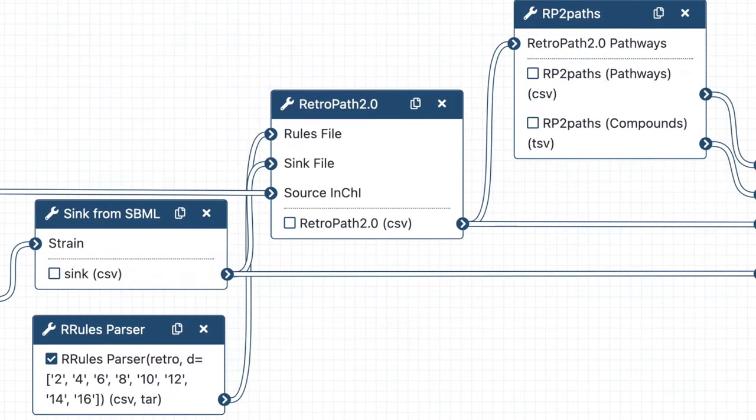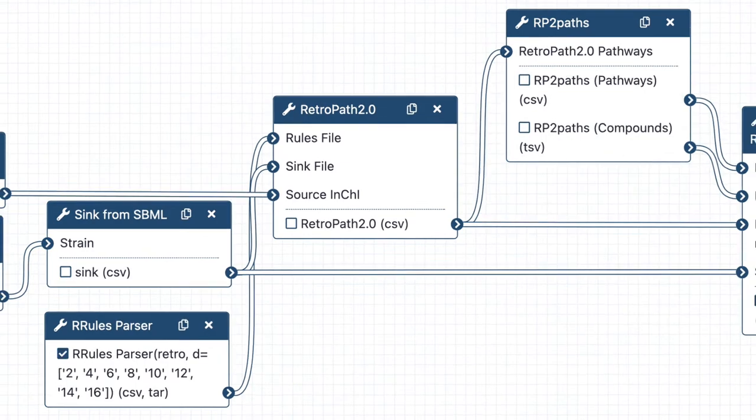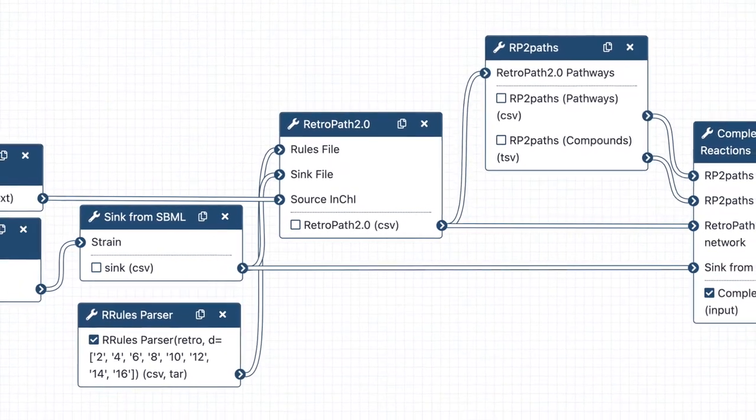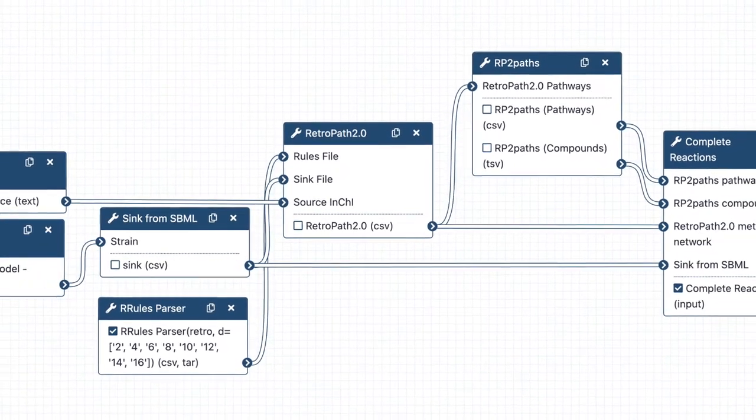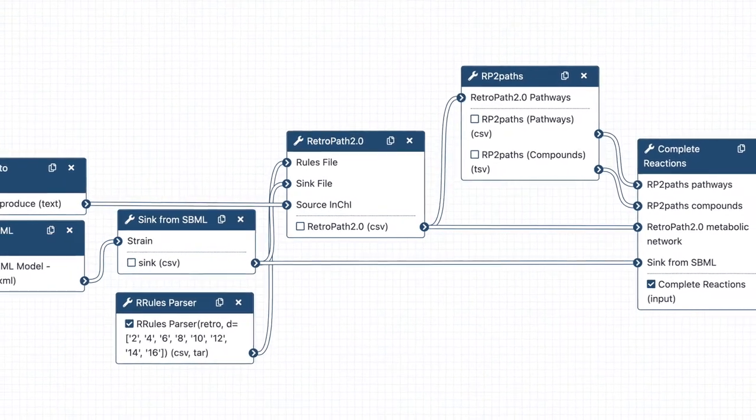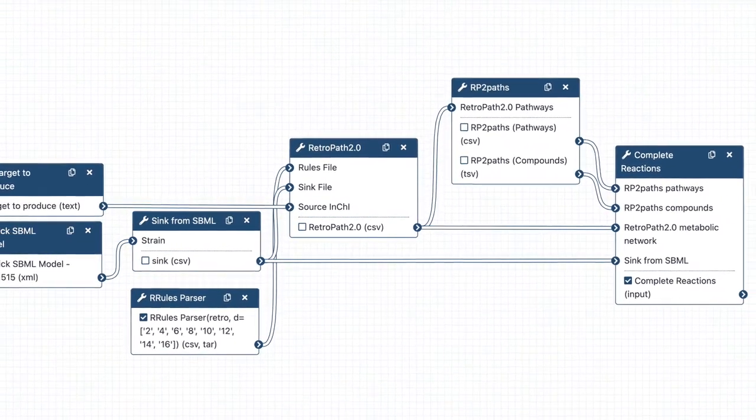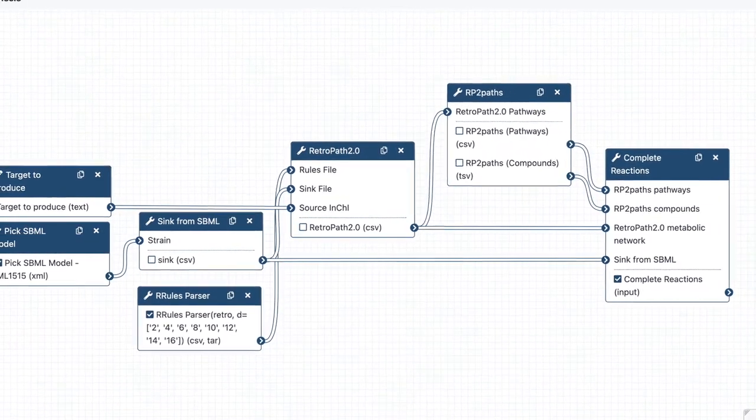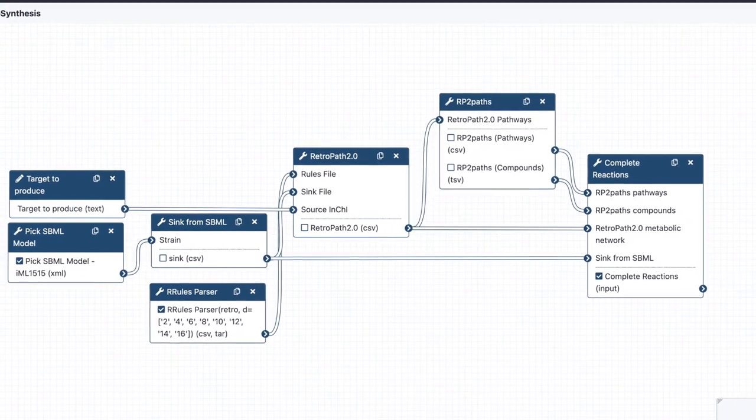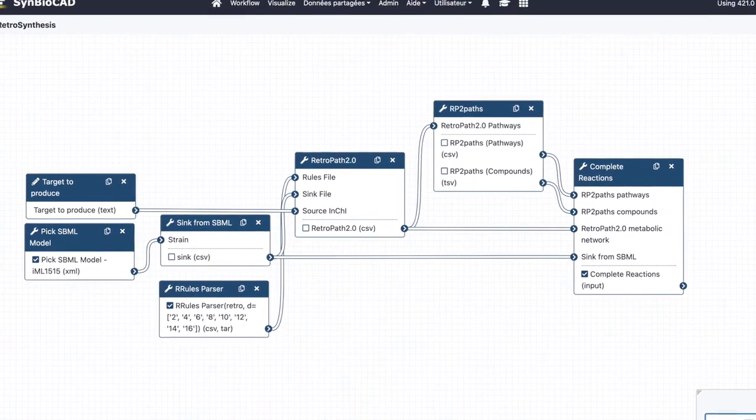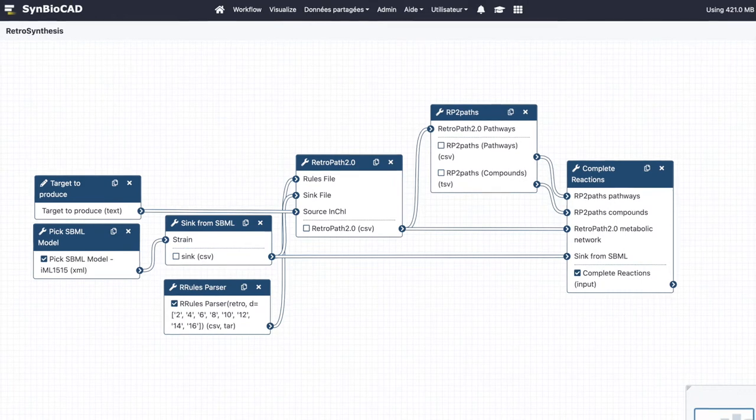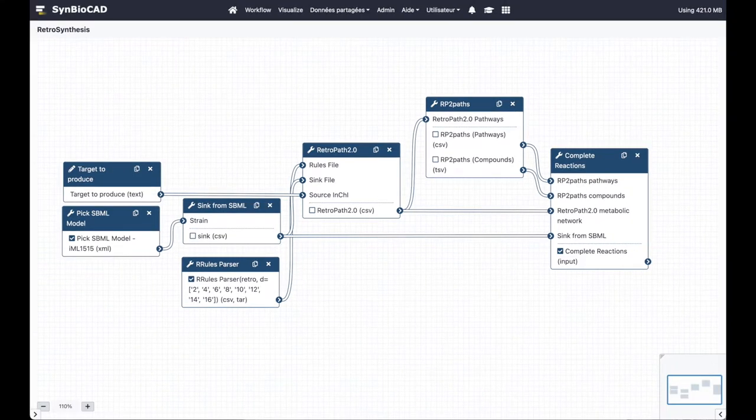Here is the retrosynthesis workflow as it appears in the Galaxy workflow editor. We can see the three main steps: Retropath 2, RP2Path, and complete reactions. The inputs are the InChI of the target to produce and the strain we want to produce the target from in SBML format.